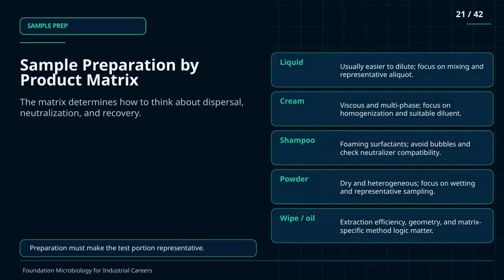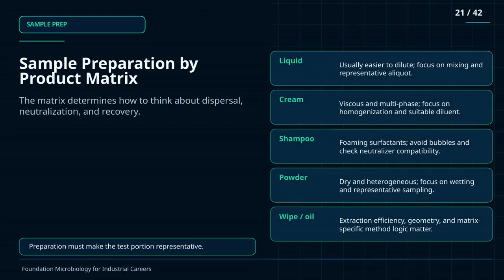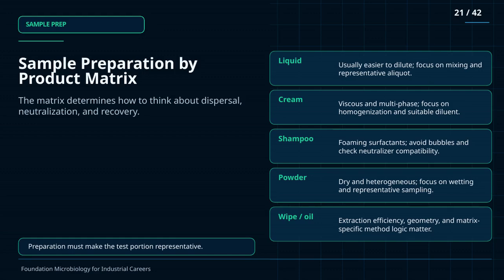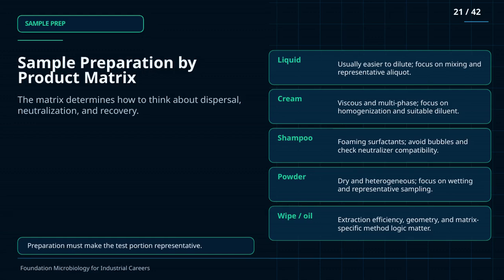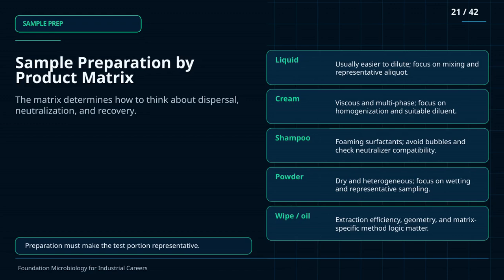Cosmetic microbiology covers microbial limits testing, preservative efficacy, water and environmental monitoring, and complaint investigation. It links laboratory evidence with formulation, manufacturing, packaging, hygiene, and risk-based quality decisions.